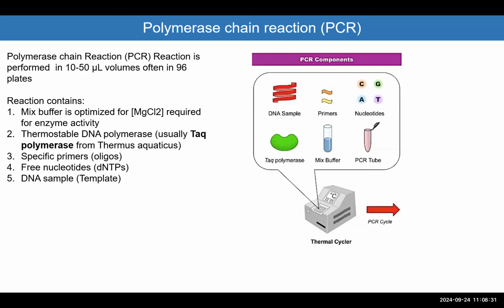So it's going to read the helices and perform the duplication process by reading a template and filling the gaps. You will need the DNA that will be the sample or the template that you will read from. You will need the primers, which are the shorter fragments around the size of the DNA that you need to amplify. And you will need dNTPs, the C, the G, the A, the T. Okay?